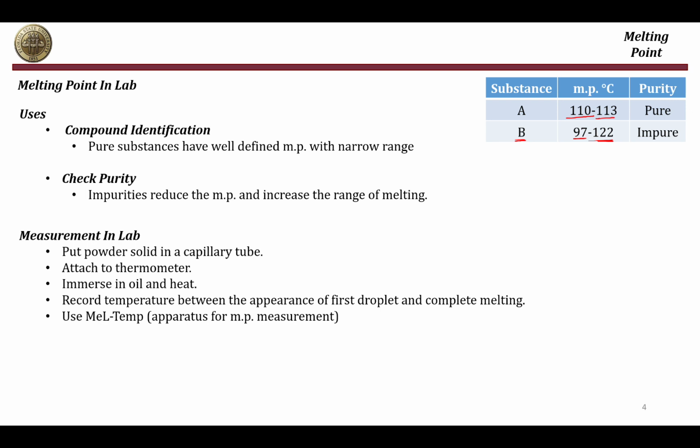There is also another apparatus which can be used to measure the melting point instead of using the thermometer and the oil bath, and it's called the Mel-Temp, and this also helps in measuring the melting point in a more accurate way.